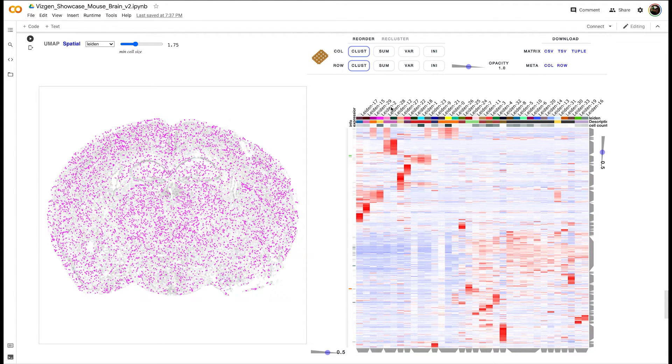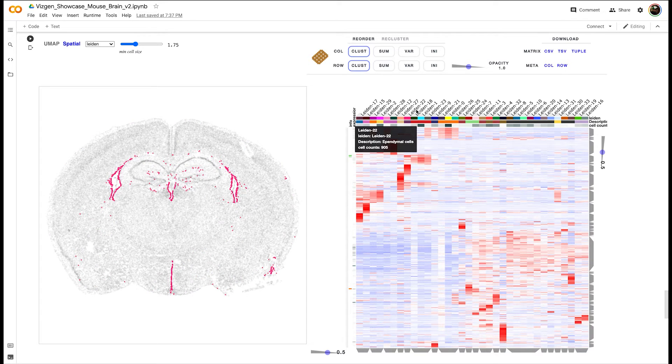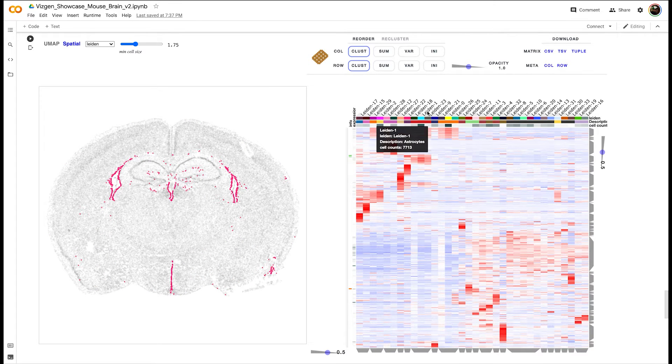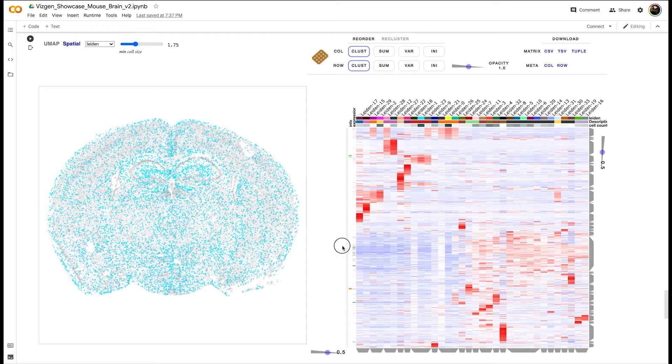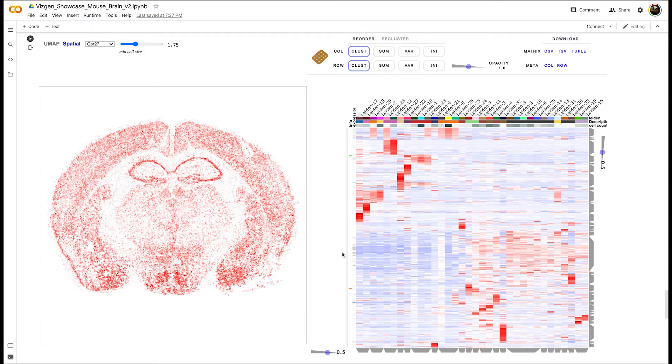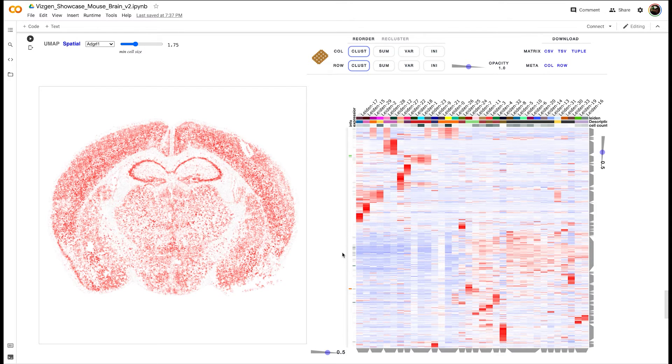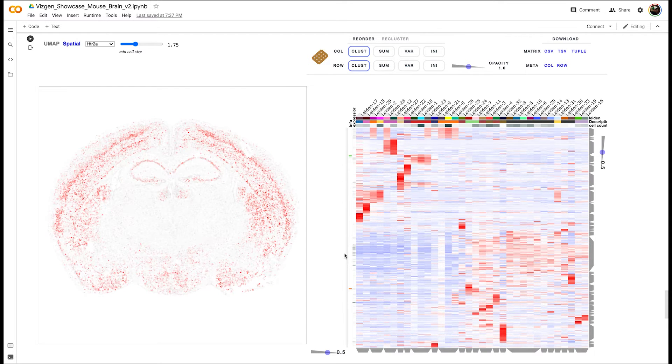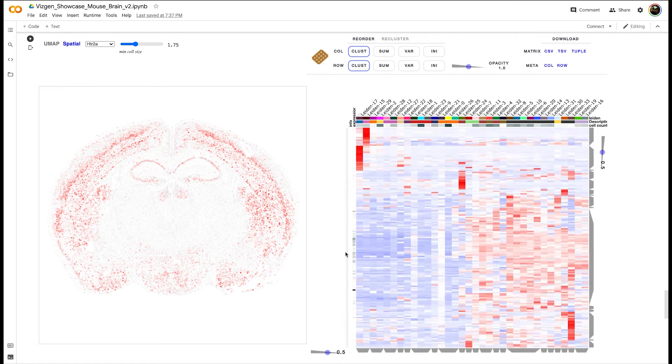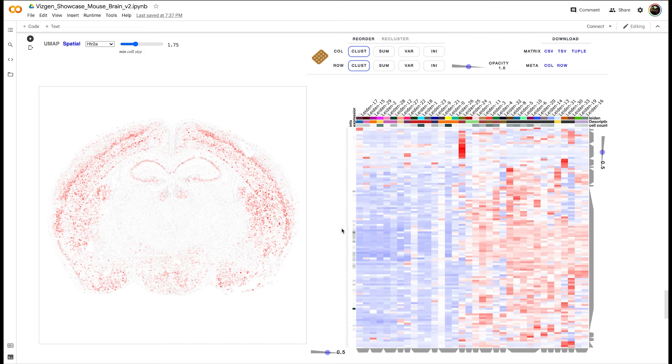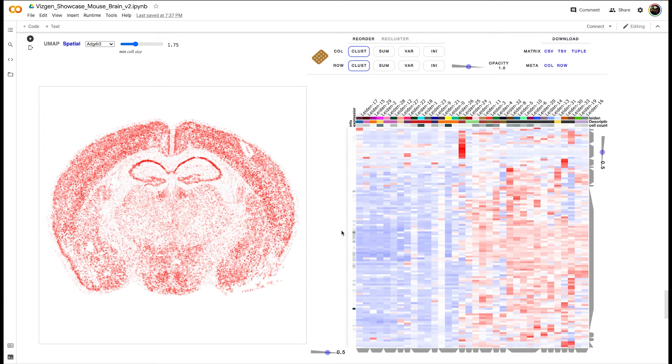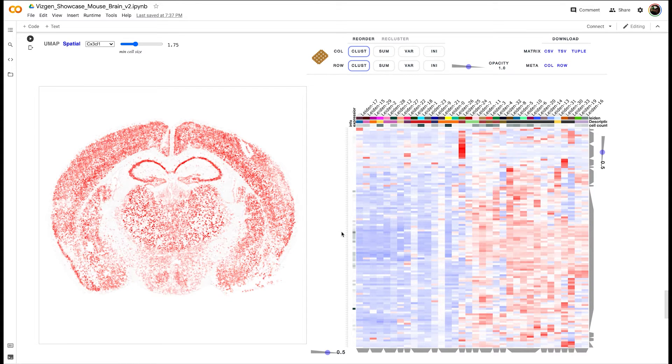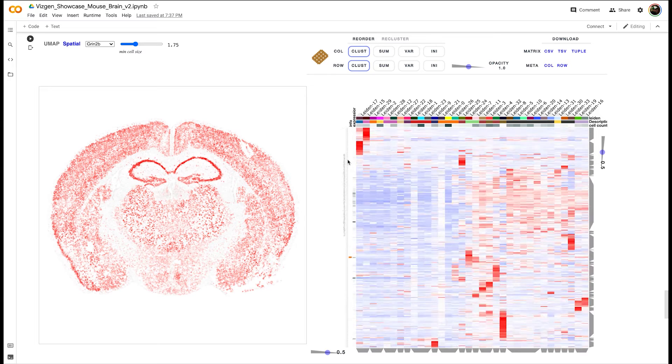You can click individual columns to highlight where that cluster of cells is, but then you can also click any row to see where any particular gene is located. If you click genes that are clustered near one another, you're going to probably see similar spatial localization within the tissue.